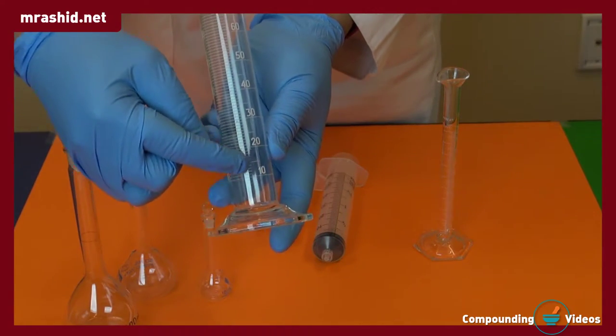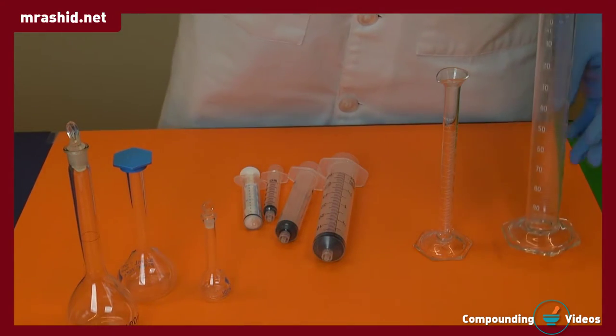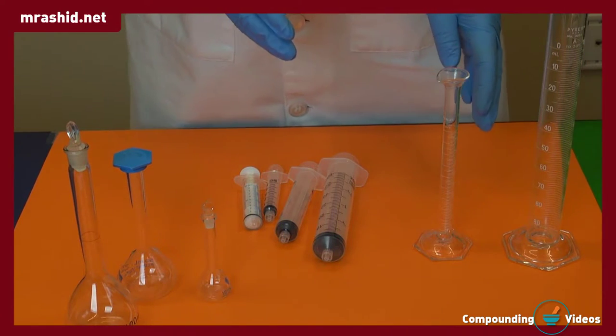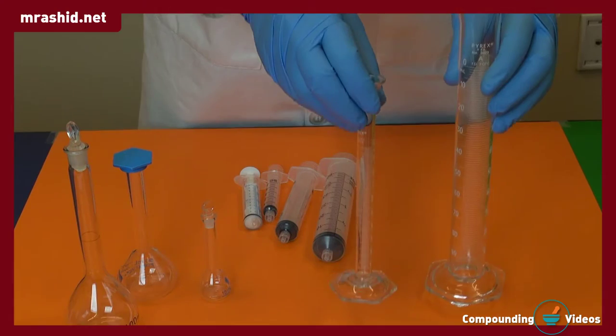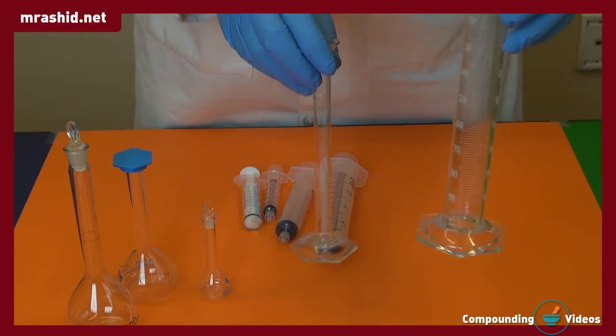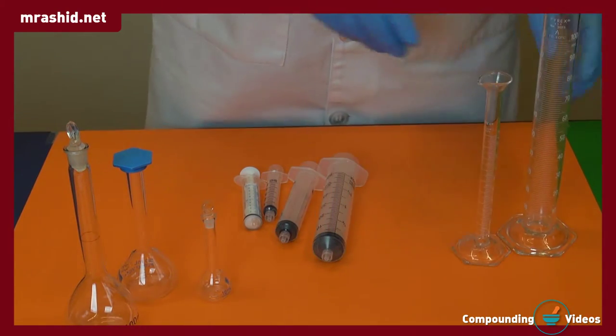Suppose we need to measure 10ml of a liquid. In that case, using the smaller one will be way better than the larger one. Reading from the lower meniscus and cylinders with wider diameter results in higher error.